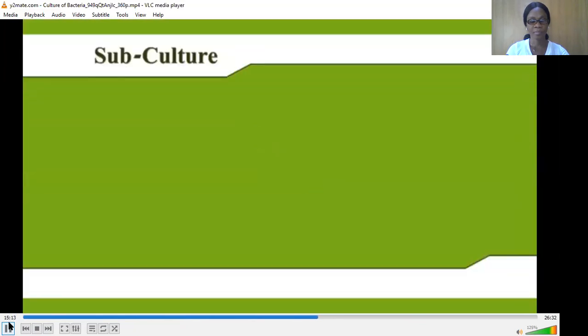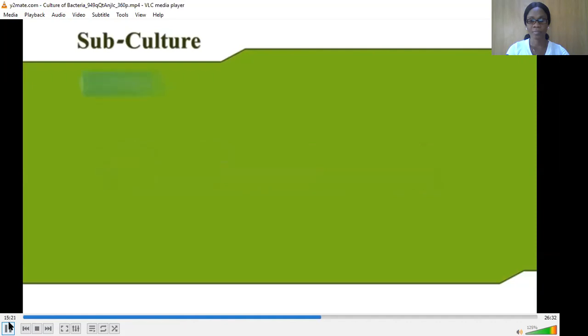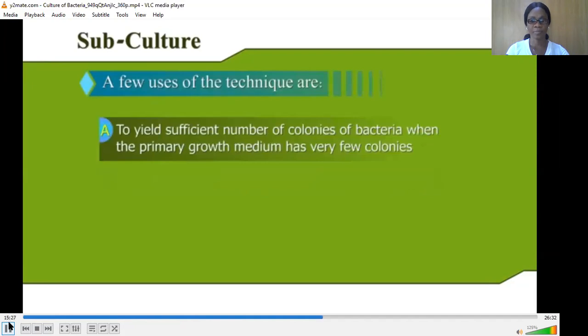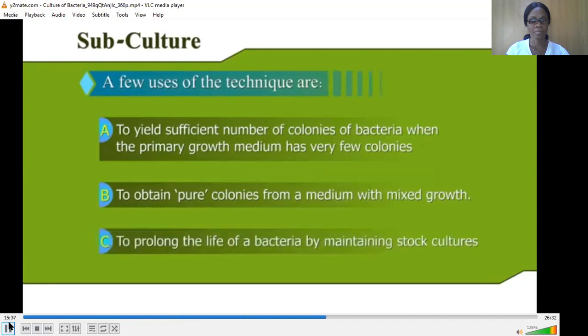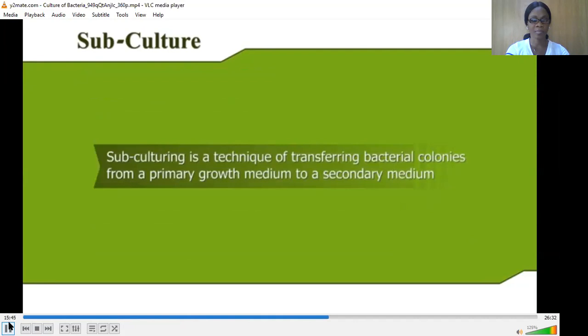Subculture. Subculture is a technique by which a new culture of bacteria can be obtained on a fresh medium from an old culture. A few uses of the technique are to obtain a sufficient number of colonies of bacteria when the primary growth medium has very few colonies, to obtain pure colonies from a medium with mixed growth, and to prolong the life of a bacteria by maintaining stock cultures. Subculturing is basically a technique of transferring bacterial colonies from a primary growth medium to a secondary medium.